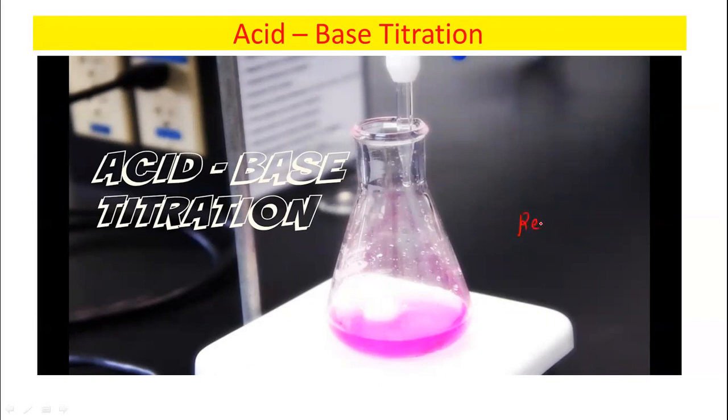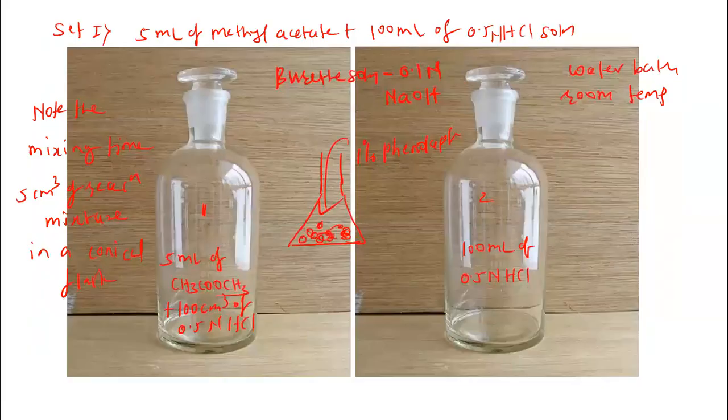because we have taken a reaction mixture which contains 0.5 normal HCl solution as well as some quantity of methyl acetate. Initially there is no reaction, because immediately after the mixing we have withdrawn 5 ml of the reaction mixture into this conical flask. So the reaction has just started.